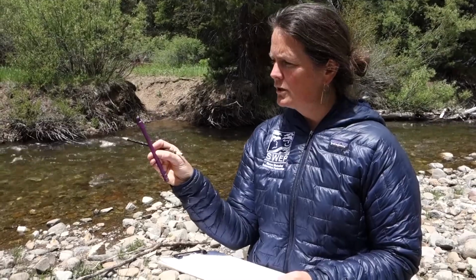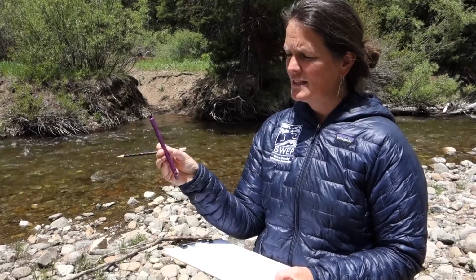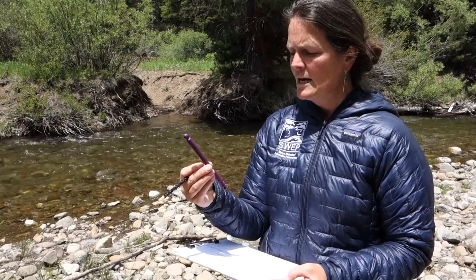So first you're going to want to orient yourself to your thermometer. You want to check and see, is it Celsius or Fahrenheit? So make sure you look for evidence to see which one it is. This one is reading to me in Celsius. And then orient yourself to the scale. Make sure you understand how the scale on your thermometer works.